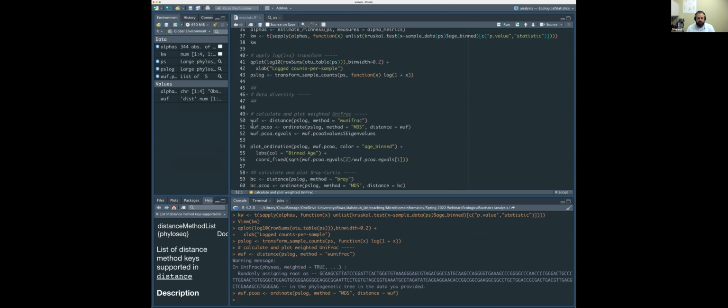The nice thing about phyloseq's ordination plot is that it doesn't show it square, as a lot of ordination plots you'll see do, and I'm guilty of this as well. Based on the human visual system, it gives us a better idea of the relative contribution of each of the axes.